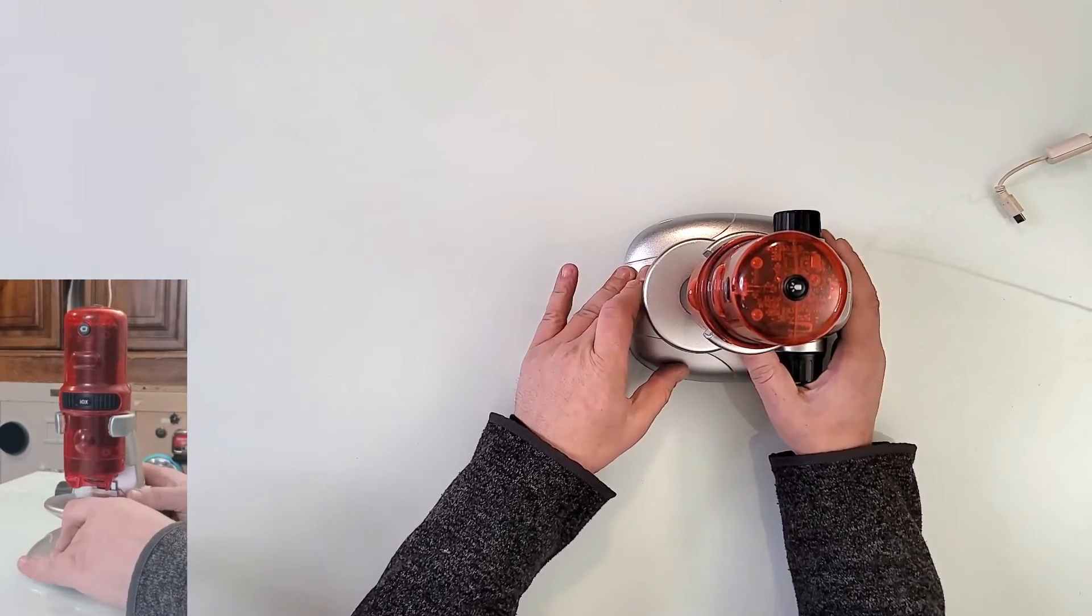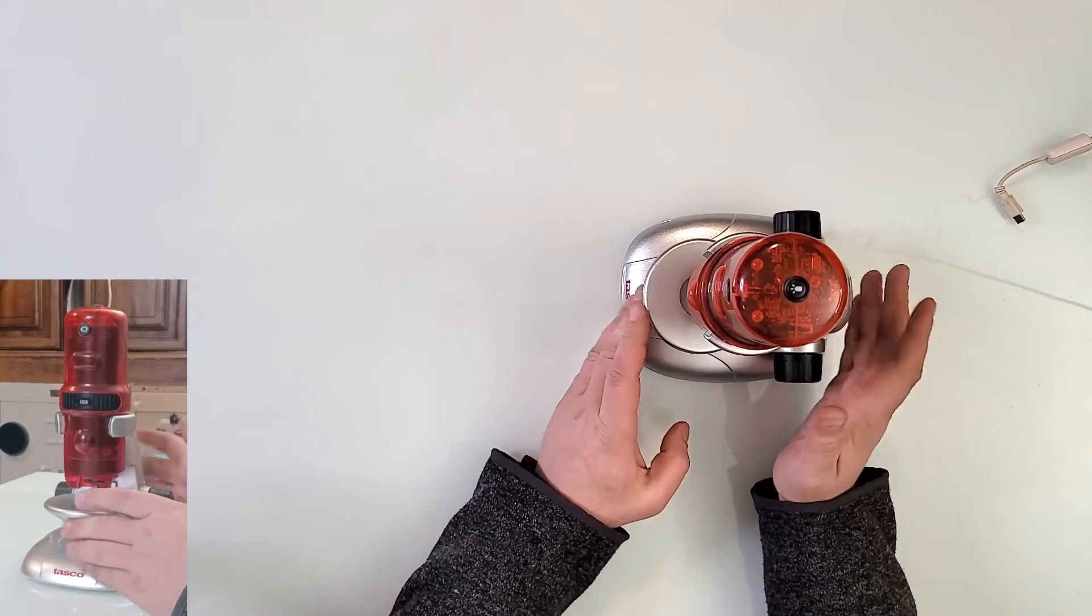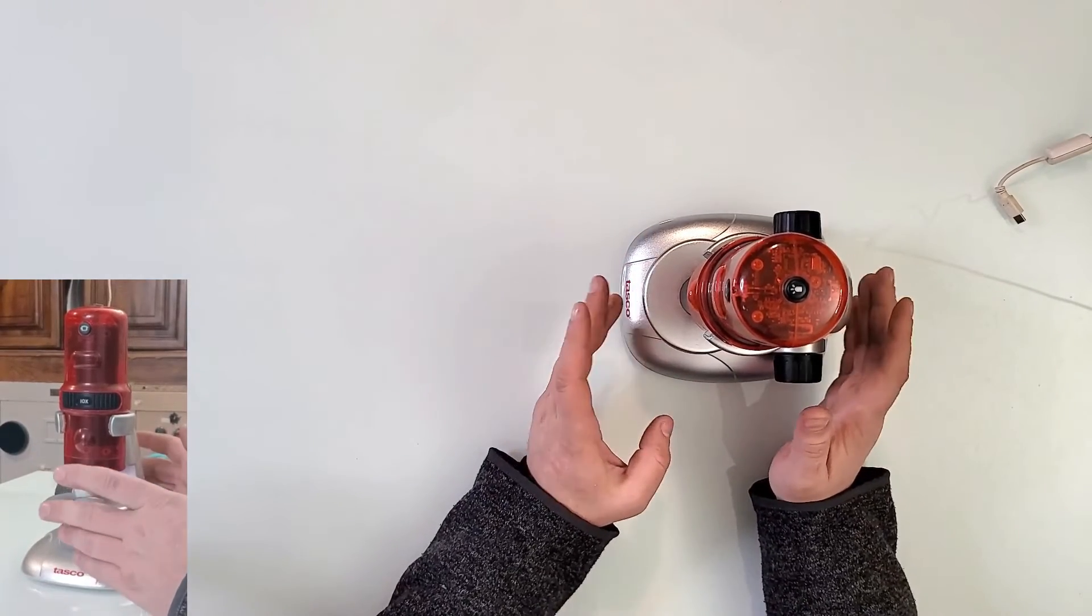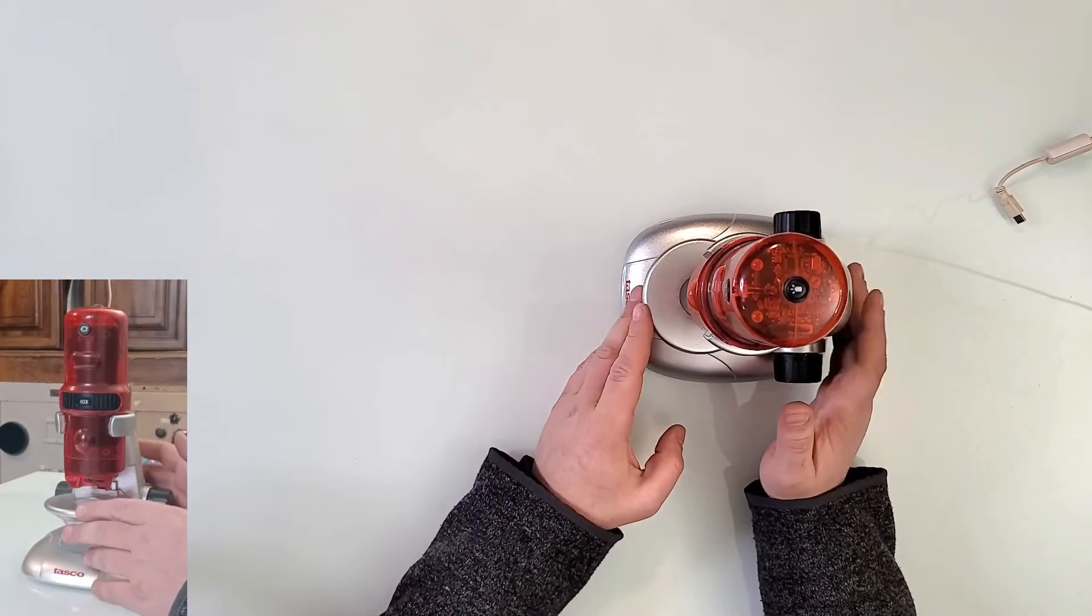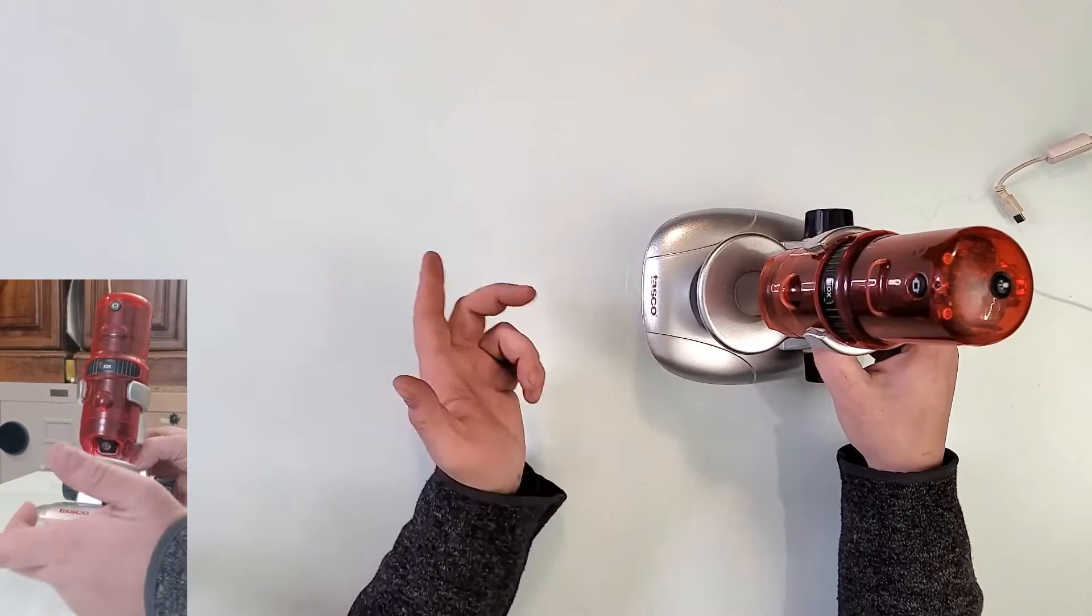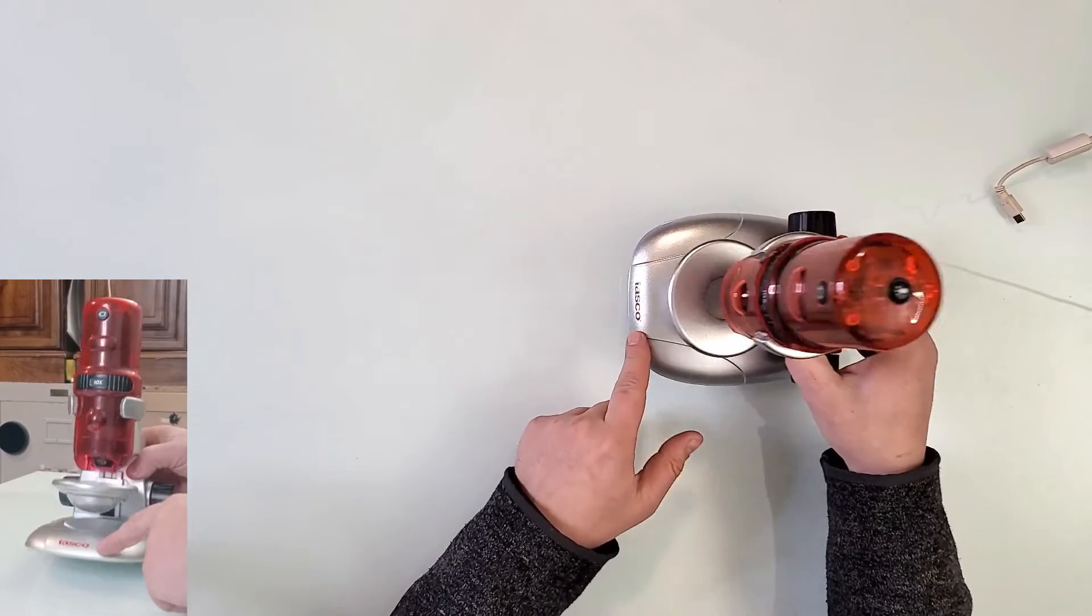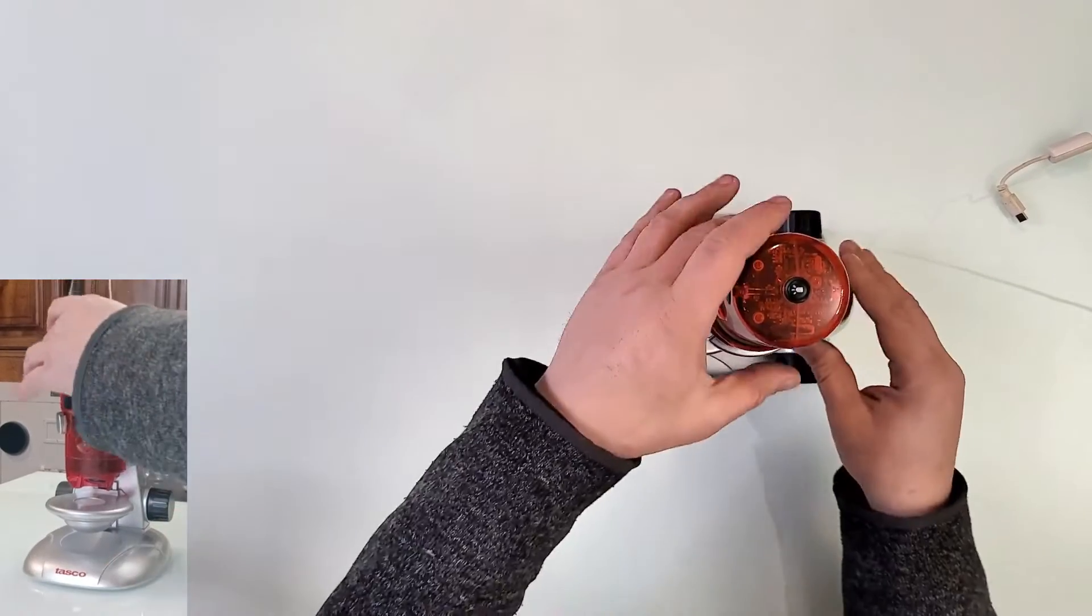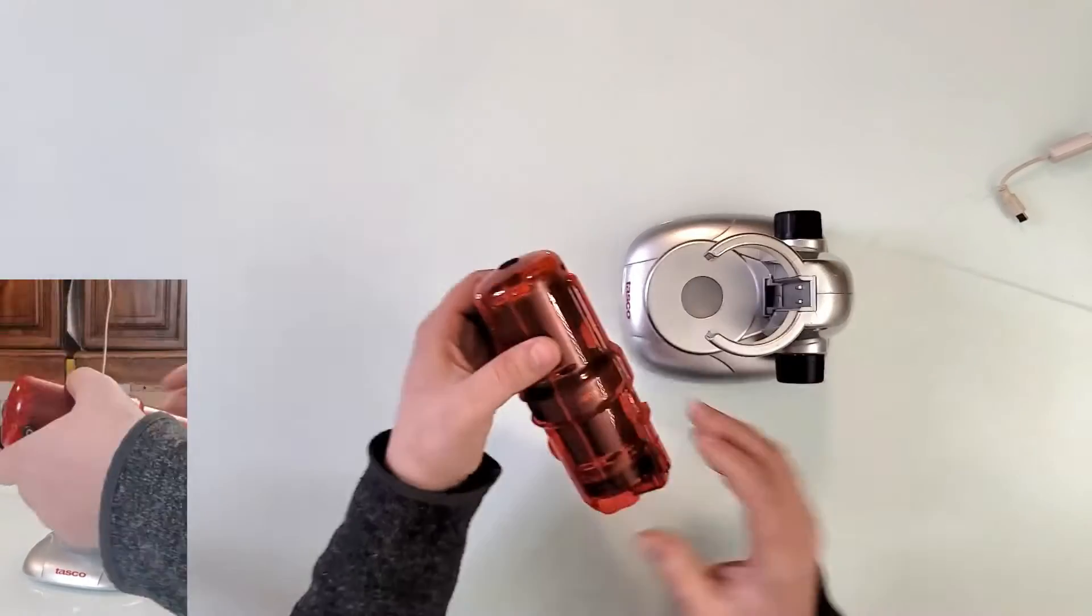This camera here is called Avio Cheetah 3. It's made by Tasco, whatever this company stands for, and it's a microscope.